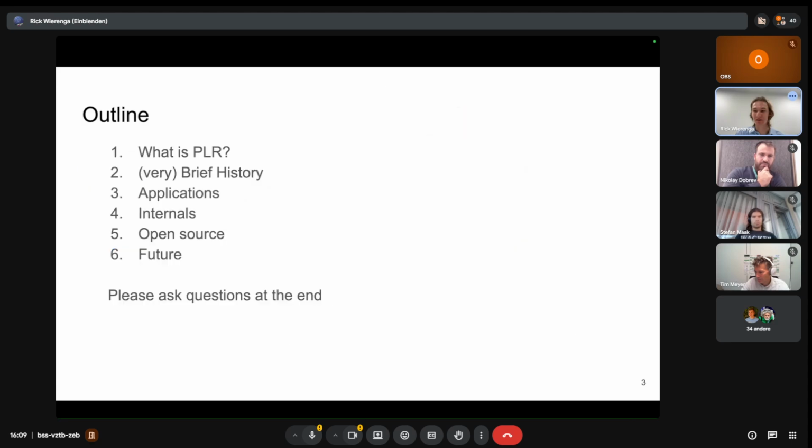So specifically today, I'll be talking about, first of all, what actually is PyLabRobot, what am I actually talking about? Then give a very brief history, talk about some applications, then go into briefly how it works internally, talk about why I am such a big fan of open source, and then shed some light on the future plans. And please ask questions at the end.